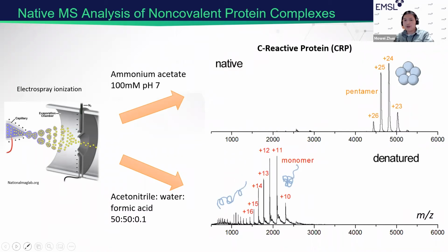And we can do a lot of interesting mass spec experiments on them, including getting the stoichiometry and also trying to understand the ligand binding properties.